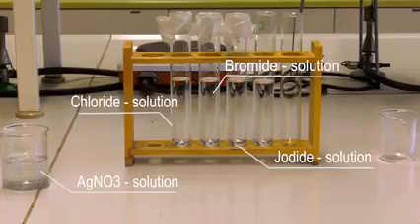For the detection of chloride, iodide, and bromide, we need silver nitrate, ammonia, sodium chloride, sodium iodide, and sodium bromide.